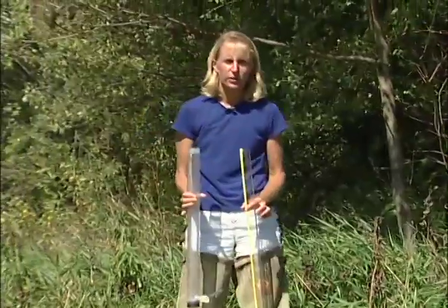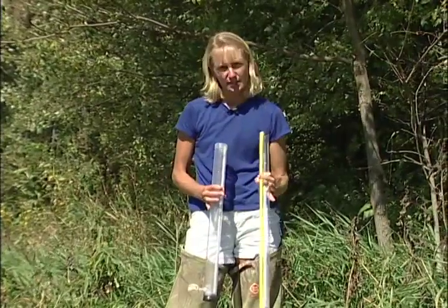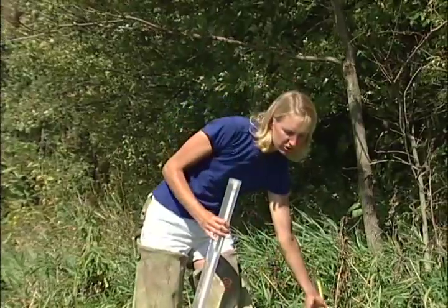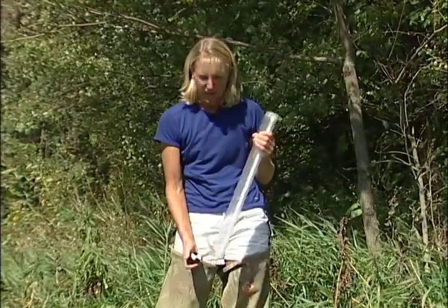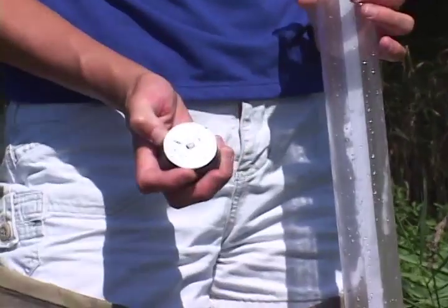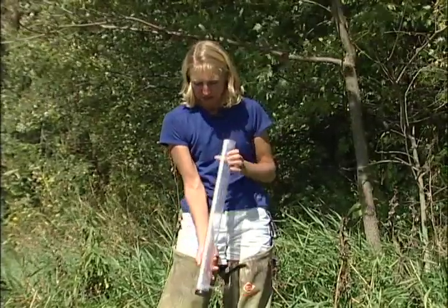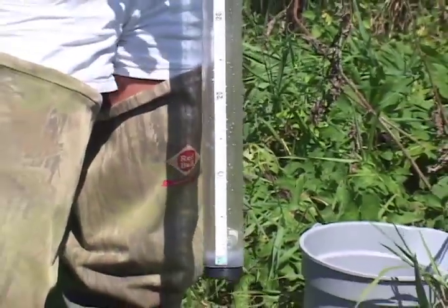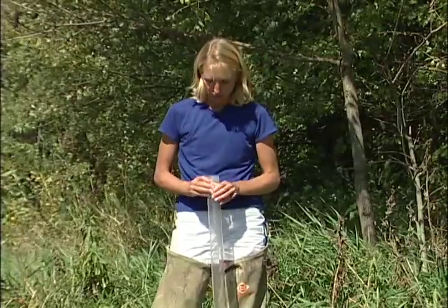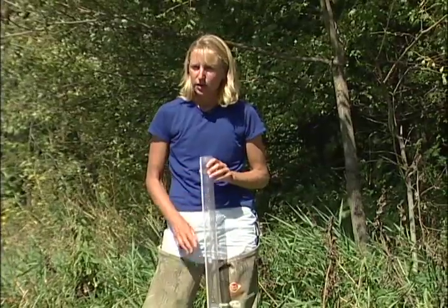There are two different kinds of turbidity tubes. One has a release valve on the bottom and the other does not. Regardless of the kind you have, they are made the same way — with a Secchi disc, or black and white disc, in the bottom of the tube. Along the side of the tube there's a measuring tape, which you'll read to get the height of the water column after you pour water into the tube. You're going to look down and see how much water you need until you can just barely see that black and white disc in the bottom.